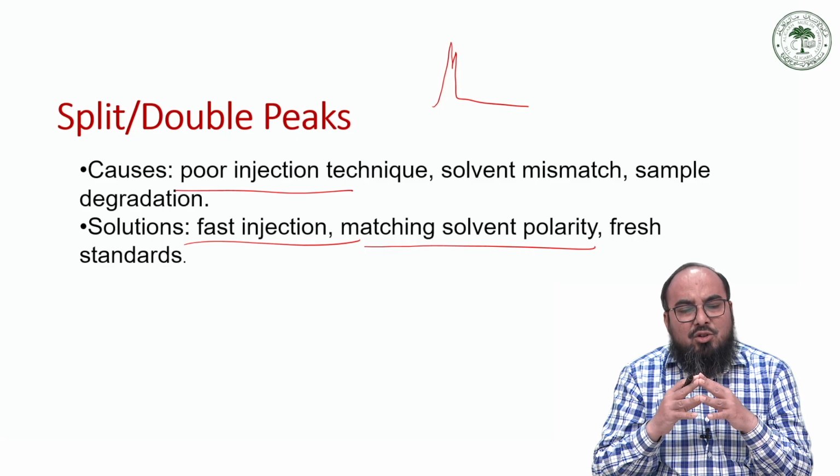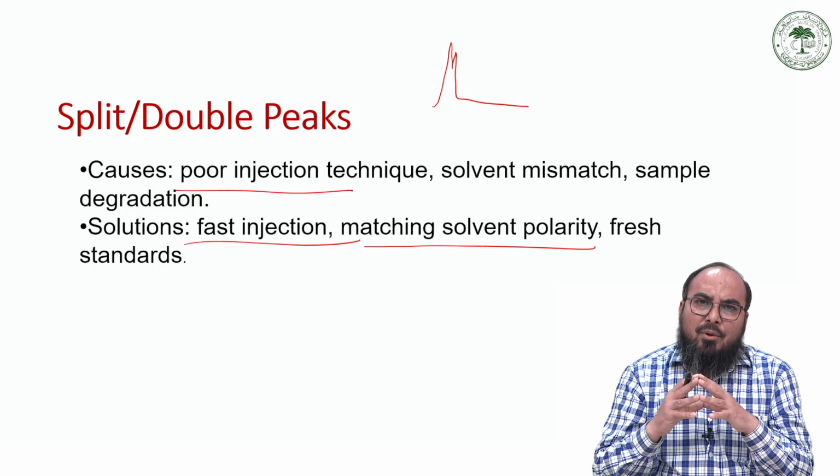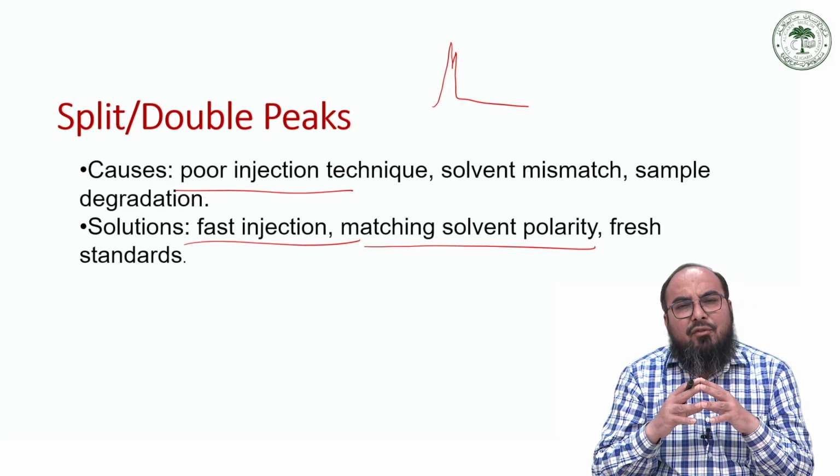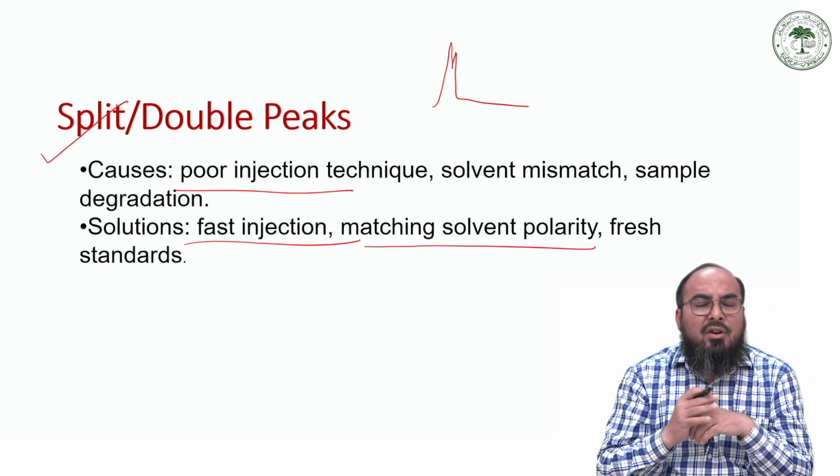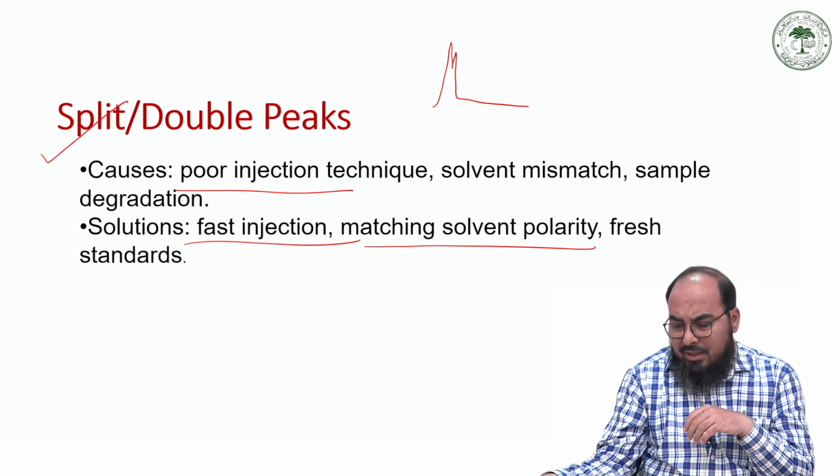that your solvent actually matches the polarity of the stationary phase. Similarly, if the problem still persists, then you can use fresh standards. Okay, so this is how you solve the problem of double peaks or split peaks.